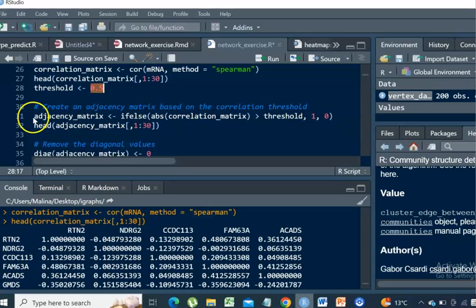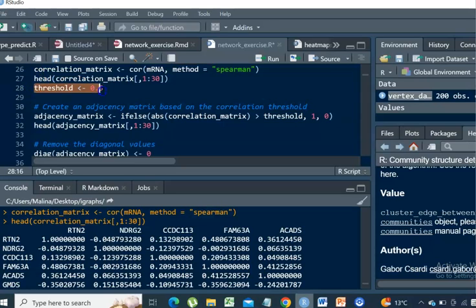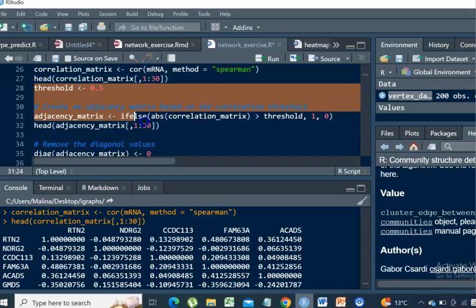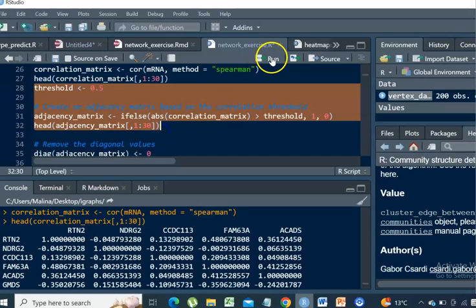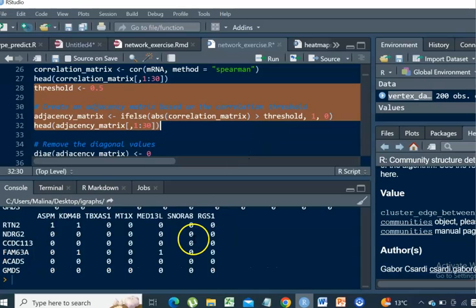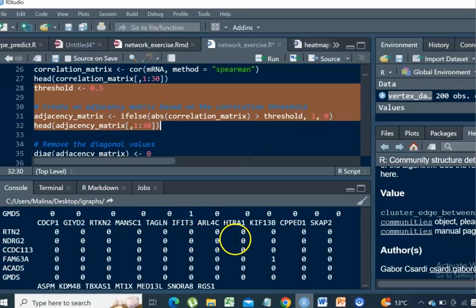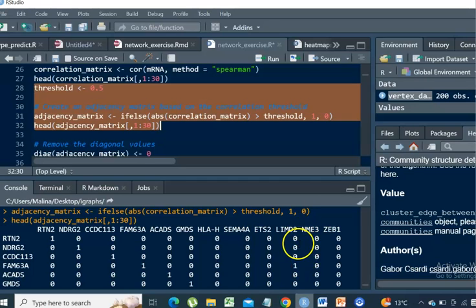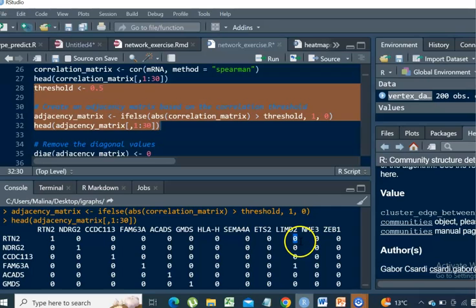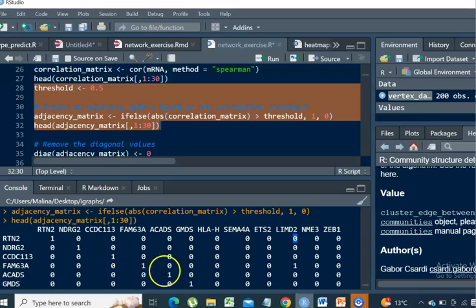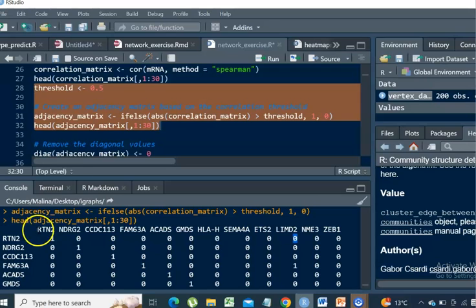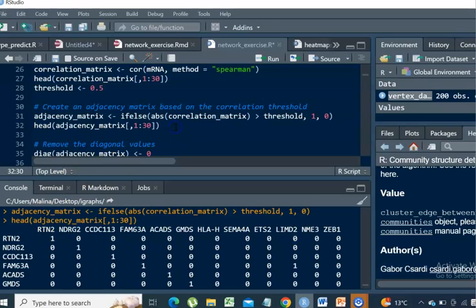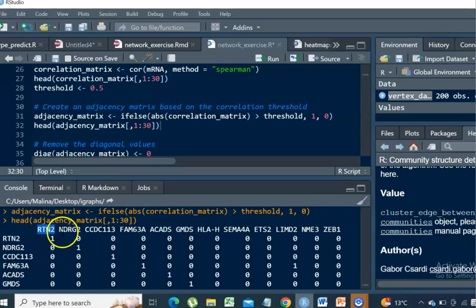Let's run all of those commands. We set the threshold here to 0.5, create the adjacency matrix, and then we are going to have a look at it. You can immediately see that compared to the correlation matrix, there are many more zeros here, because we filtered on the strength of the correlation between the gene pairs. But the diagonal is still represented by ones. It is because when a correlation matrix is created, the genes or the result of self-correlations are also outputted in the diagonal.